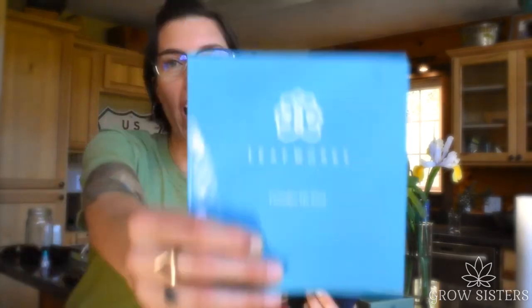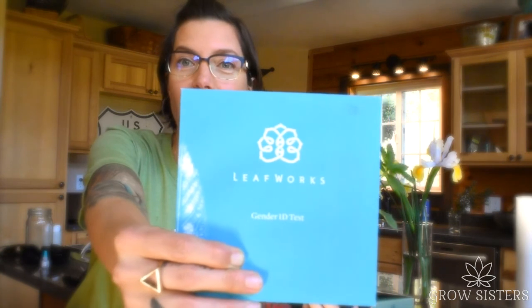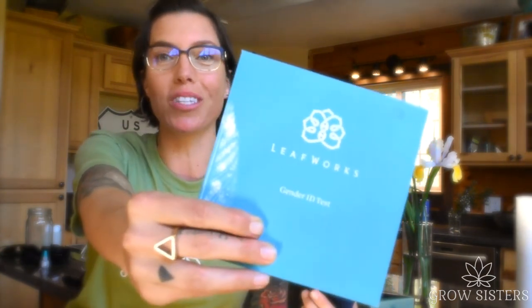Hey everyone, if you have regular seed sprouts that you've started and you don't know if this is going to be a male or a female, grab a LeafWorks gender ID test. I'll show you how to use that right now.